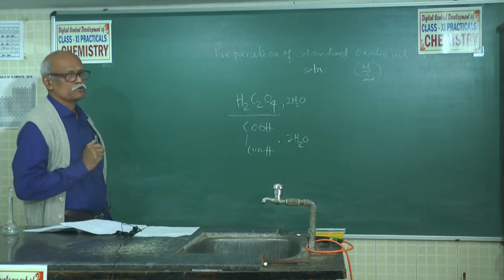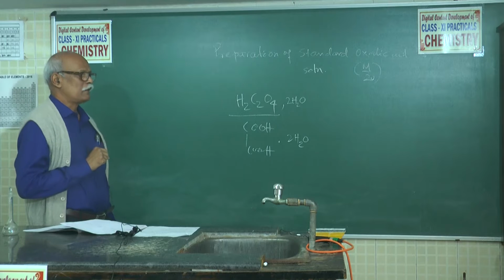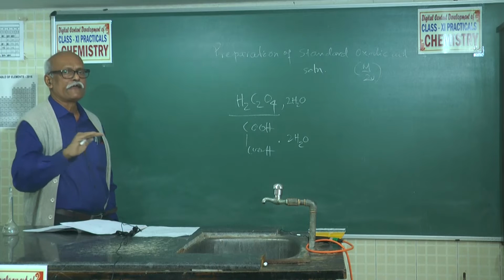But if you keep prepared potassium permanganate for this year, after 1 year that will decompose, there will be deposition of manganese dioxide.